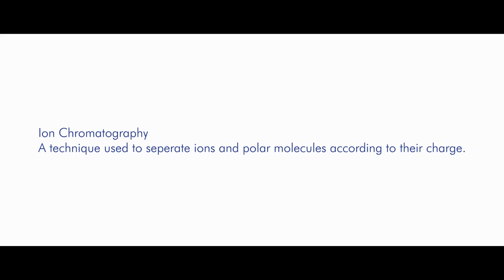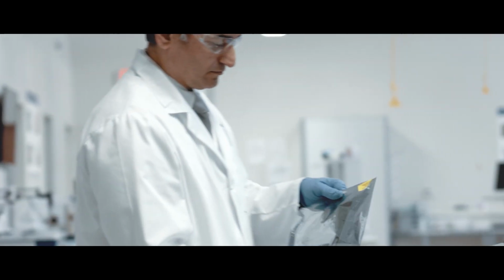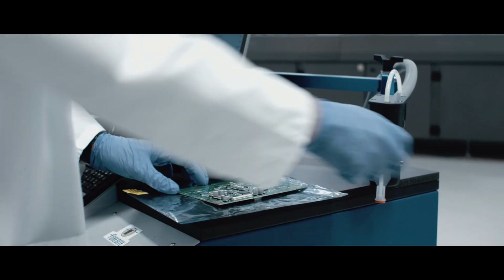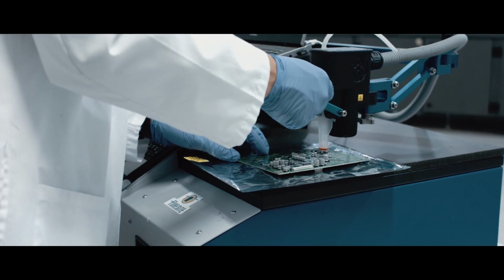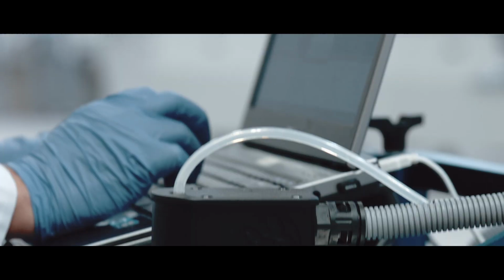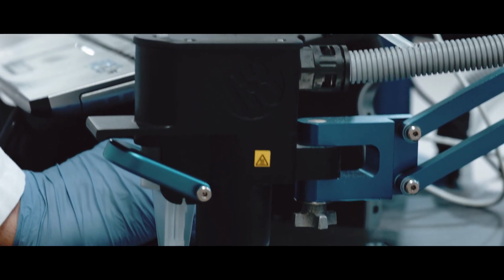Ion chromatography is a technique that is used to separate ions and polar molecules according to their charge. The test is used to identify and quantify the ionic contaminations such as fluorides, chlorides, bromides, nitrite, nitrates, sulfates, and many more. Ion chromatography testing is used by the majority of customers for their process qualification or failure analysis if they have some of the ions that are in excess during their manufacturing process.